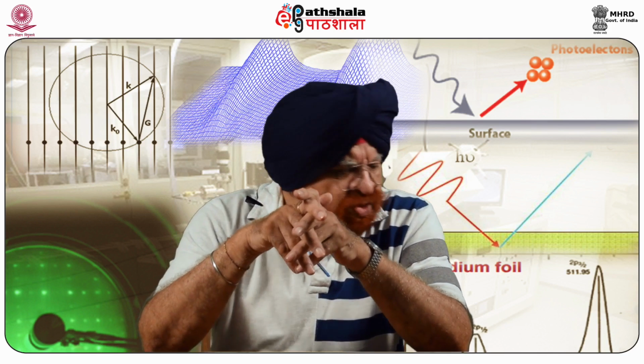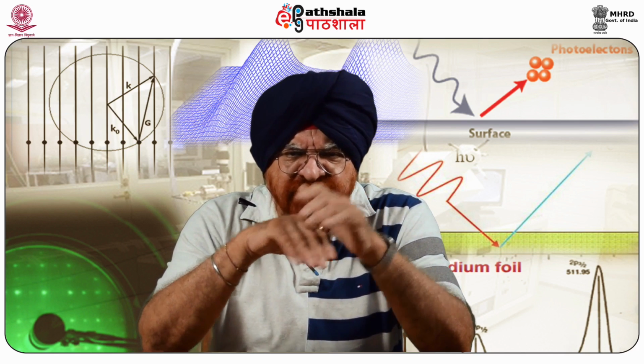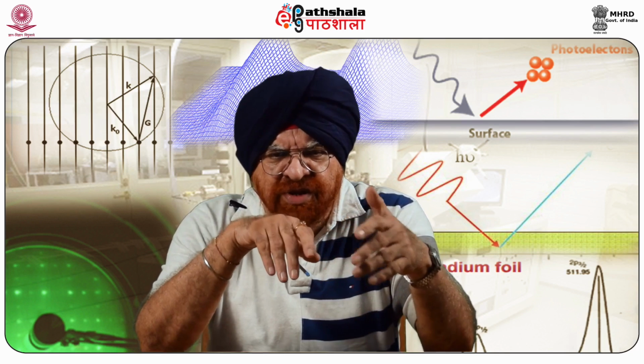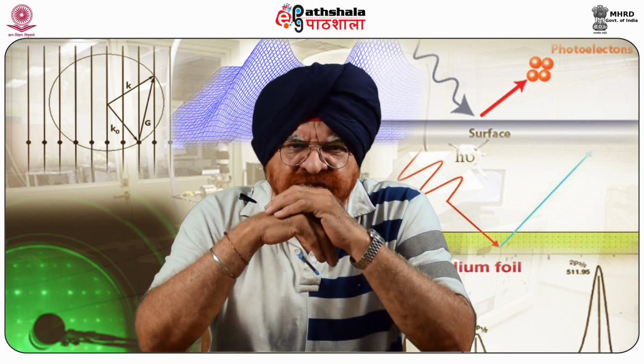spectroscopy. Usually, the problem is resolved by investigating other spectral regions for additional peaks. If that is done, then we can combine this with the help of ESCA and arrive at the exact results.